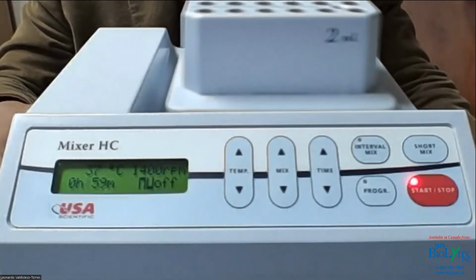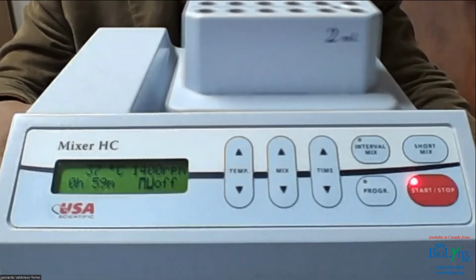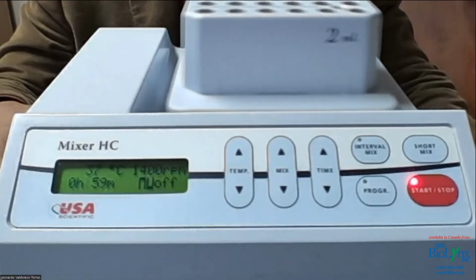Thanks, Catherine. And then next question, can we use the mixing with an overnight constant heating, as in a proteinase K incubation? I don't see why you can't. My understanding is that you should be able to do it.